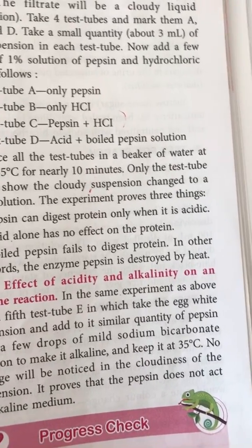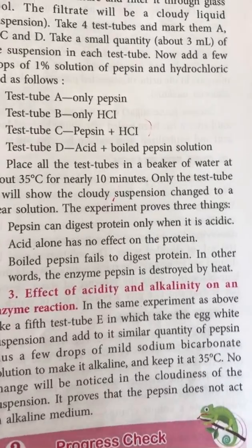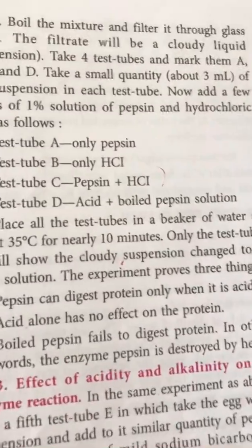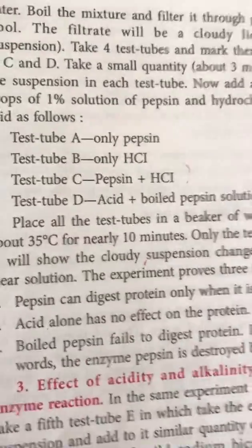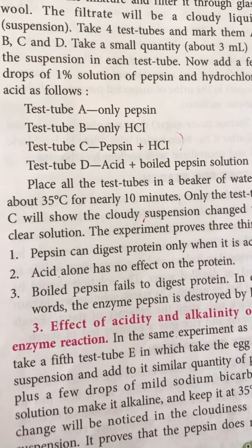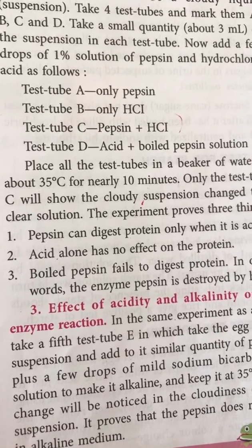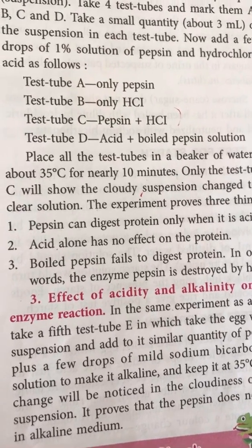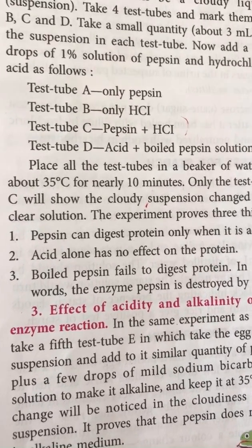Only test tube C will show the cloudy suspension change to a clear solution. The experiment proves 3 things. Number 1, pepsin can digest protein only when it is acidic. Second, acid alone has no effect on protein. Third, boiled pepsin fails to digest proteins. In other words, the enzyme pepsin is destroyed by heating.